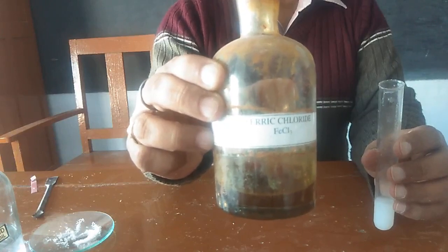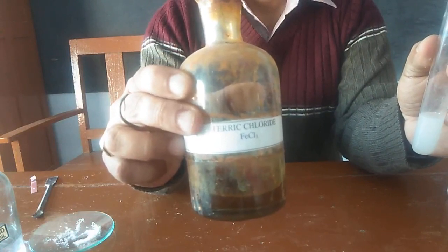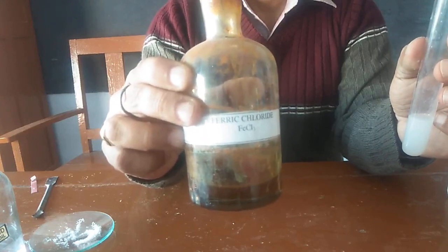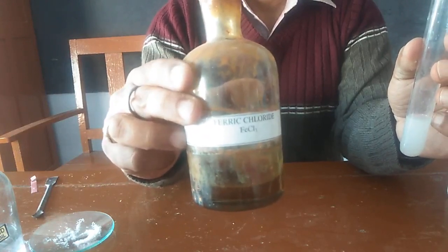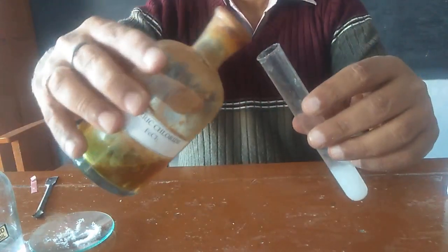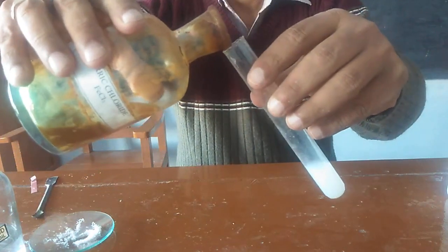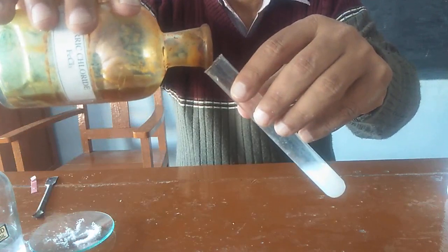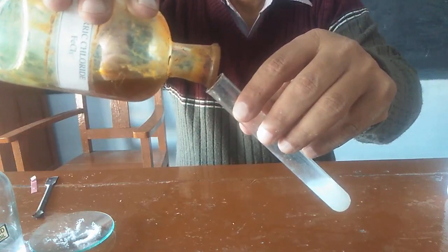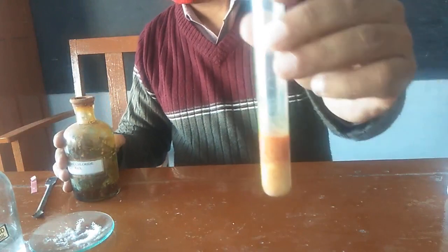The salt of FeCl3 is slightly acidic in nature. We just make it neutral by adding plenty of water or a few drops of base to it. And when we add neutral ferric chloride to an aqueous solution of a salt which has acetate ions in it, the solution will turn reddish brown.